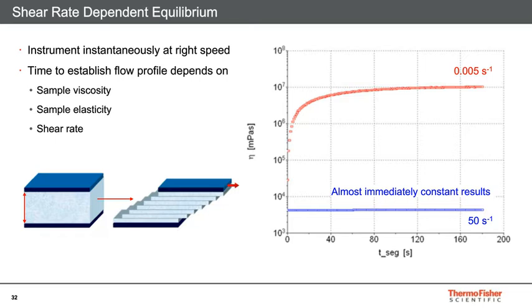However, if we reduce the shear rate to 0.005 reciprocal seconds, the same material takes much, much longer for that flow profile to develop, much longer response time. So even after this 3 minutes of interrogation, really that viscosity is still slightly increasing. It hasn't really reached an equilibrium state.